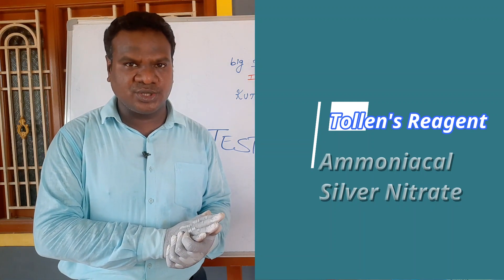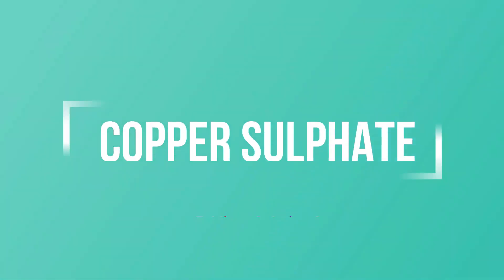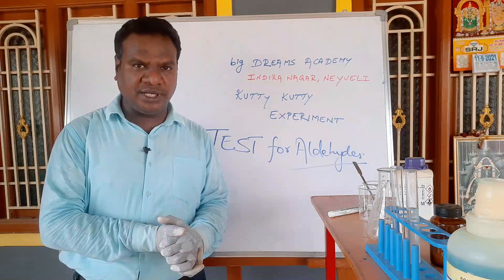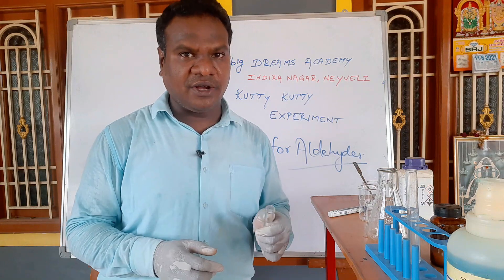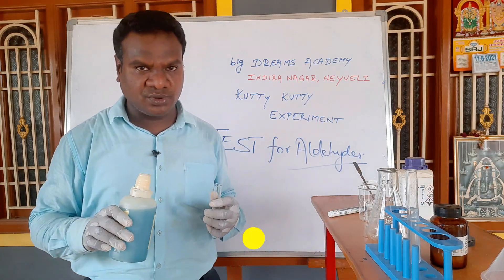Fehling solution A is copper sulfate, and Fehling solution B is sodium potassium tartrate. First, we have to prepare the Fehling solution by taking equal amounts of Fehling A and Fehling B.